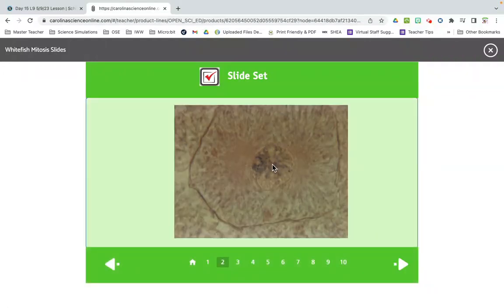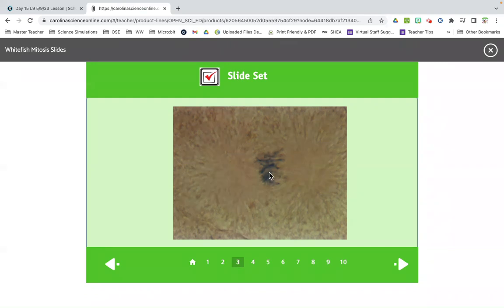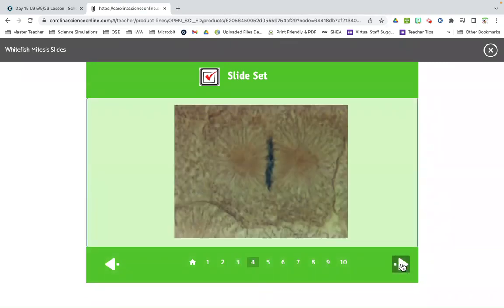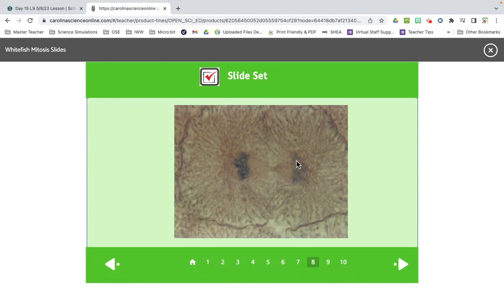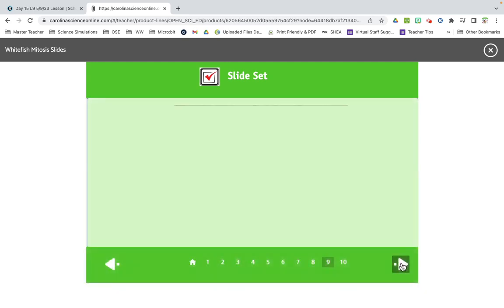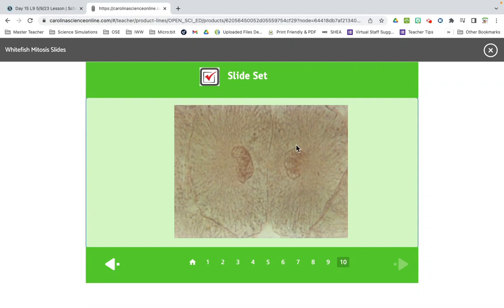And we see it breaking down again, going from something very obvious to something that's just breaking down into pieces. It goes towards the center, forms a line, starts pulling apart, pulls apart a little bit more, even more. Those two strands that pulled apart start to group back together again. They turn into those bluish blobs again. Then we see those two things in the center, but now we have two of them, and again a line between them. So we've taken one fish cell and doubled it into another fish cell.